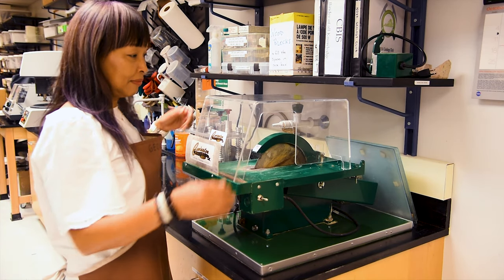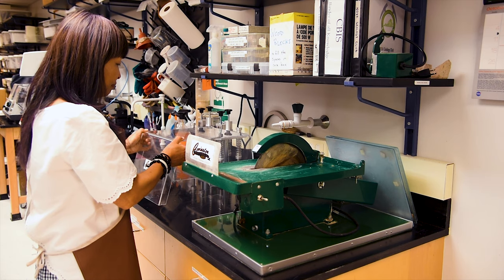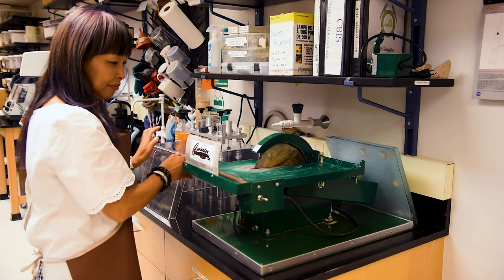While in operation, the splash guard keeps most of the water from spraying onto the operator and into the surrounding workspace. This should always be in place when the saw is running.